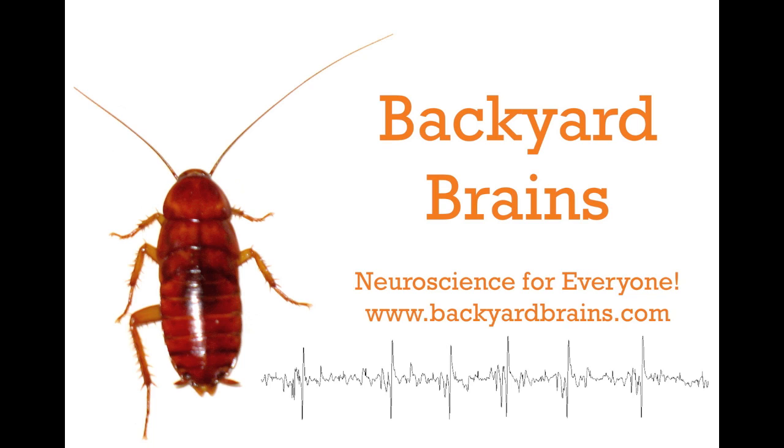So, with careful placement of your electrodes, you can find you get just as good responses from the cricket leg as you do from the cockroach. Backyard Brains — Neuroscience for everyone.